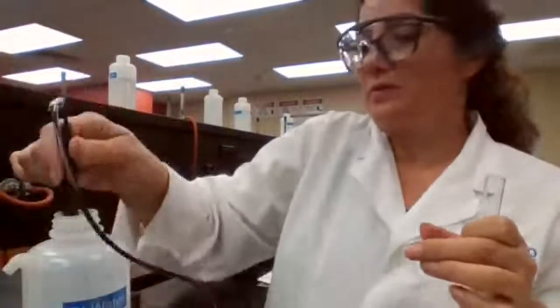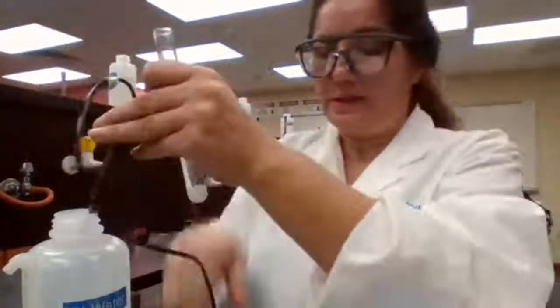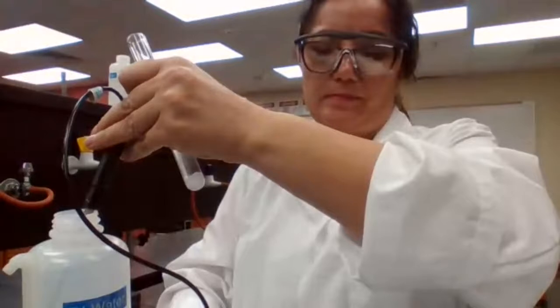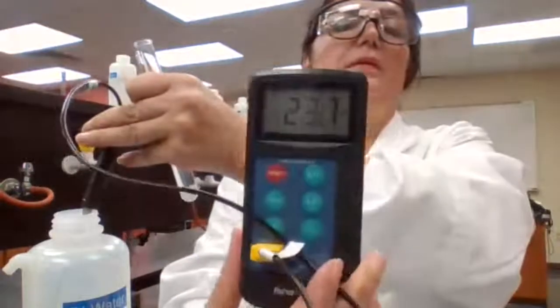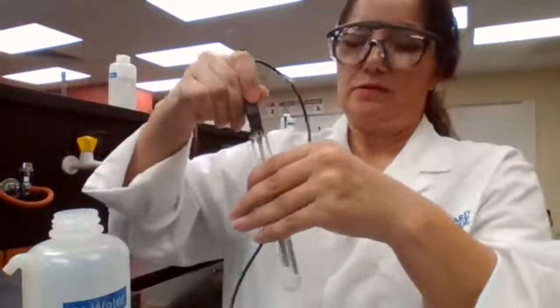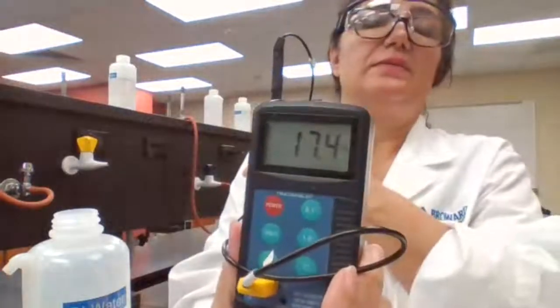The temperature of the water, deionized water, is 24 degrees Celsius, close to 25. The temperature of the solution is 23.7 degrees Celsius, then 17.4.